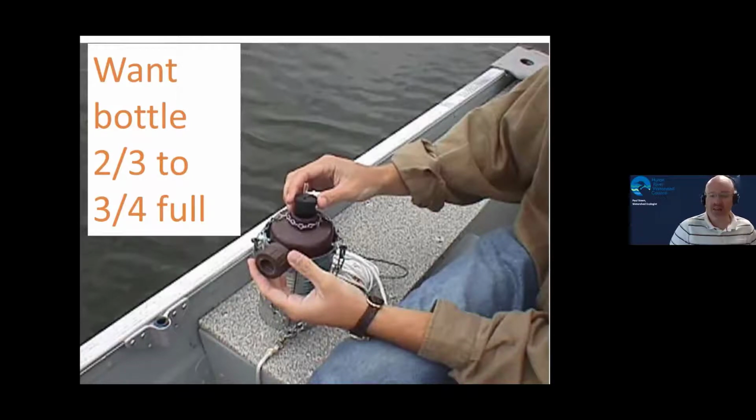Okay, so then you just want to dump it out and repeat the process. If it's too empty, you're simply not going to have enough water to do what we need you to do. So that's why 2/3 to 3/4 full is the sweet spot for how much water you're trying to collect in this process.